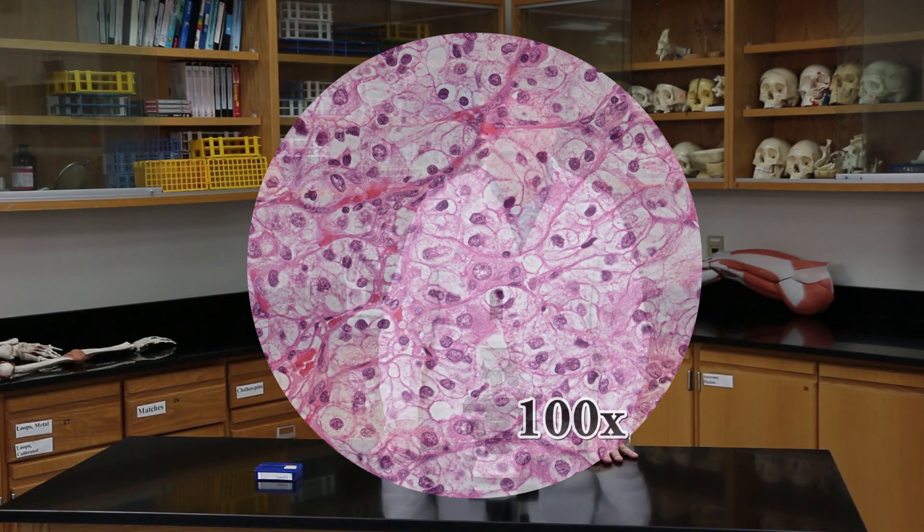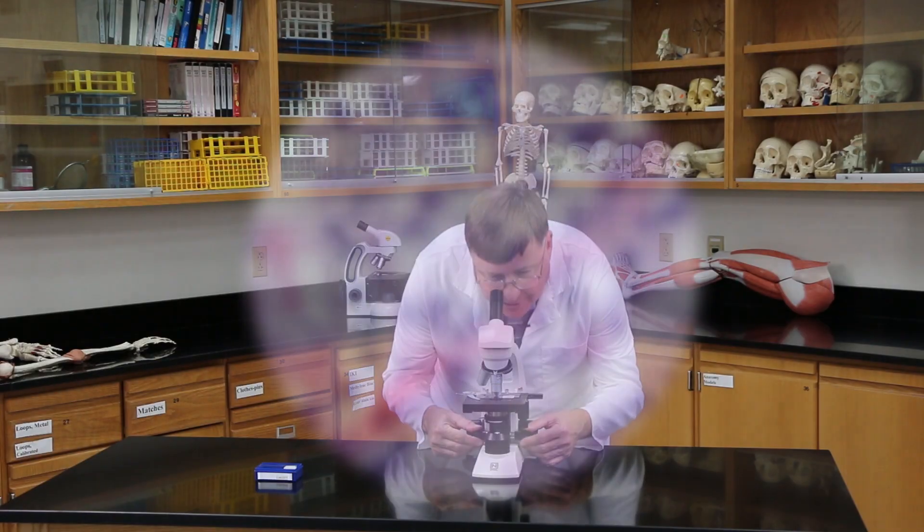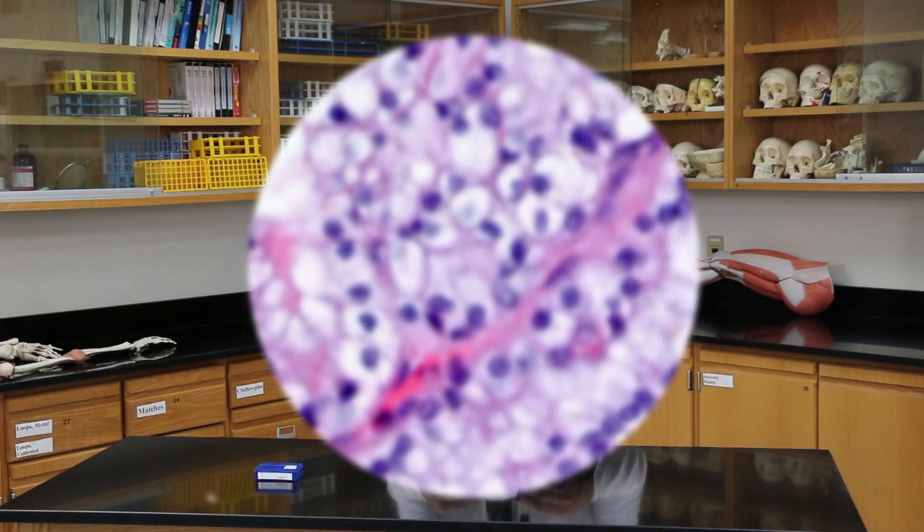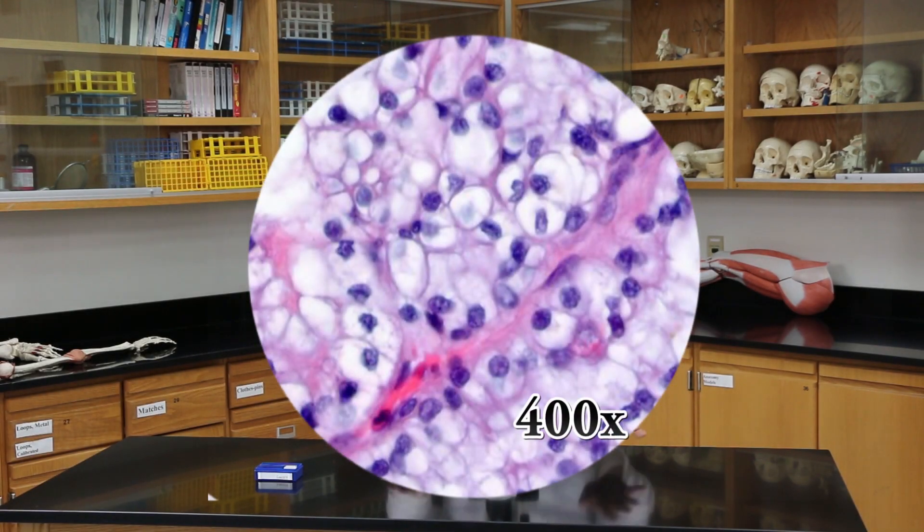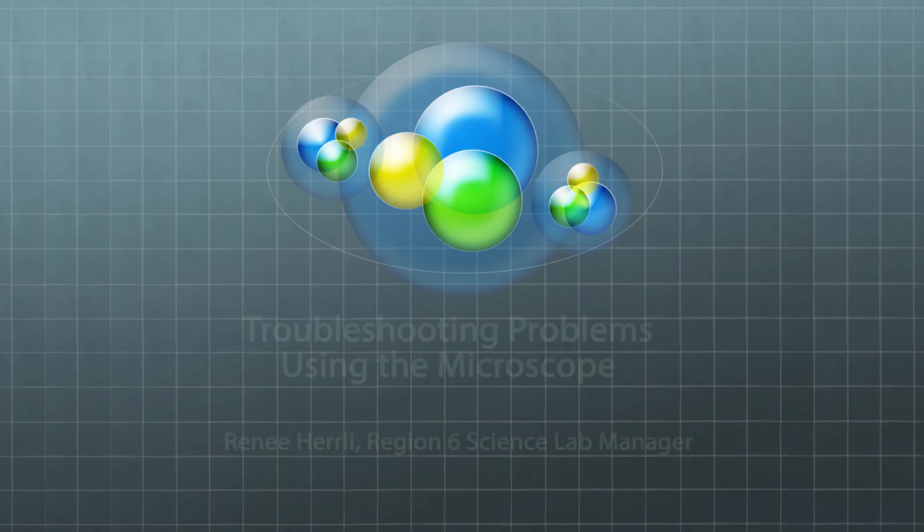And if I go to the high power lens, I'm going to turn the revolving nose piece and put the lens into place. And again, I'm going to use the fine focus. And now my image comes in the view. And that's basically how you use these microscopes.